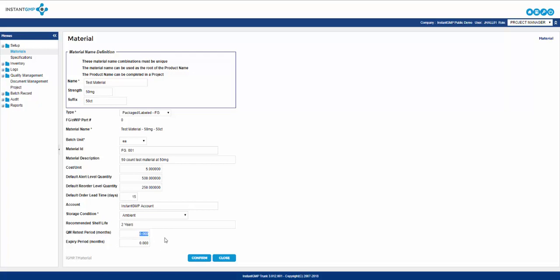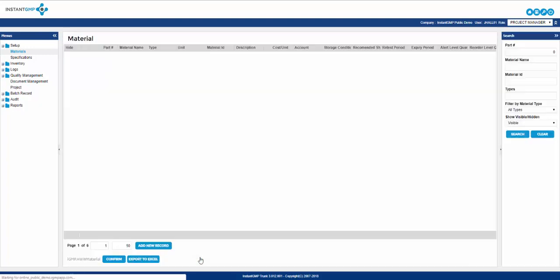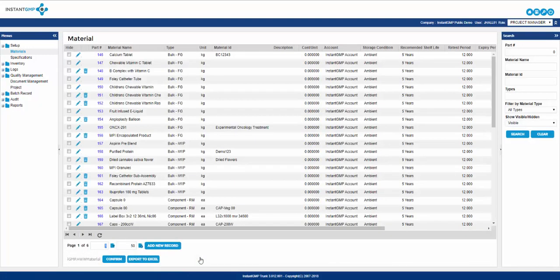Recommended shelf life allows you to specify the shelf life of a material. QM retest period in months allows you to place a retest period in which the material should be put into quarantine, retested, and released again. Expiry period in months allows you to place an expiry period in which the material will be listed as expired and should no longer be used. After you complete this material page you can confirm it and the material will be added to the list.